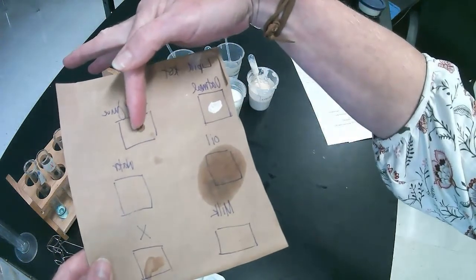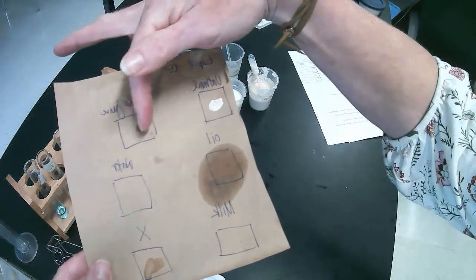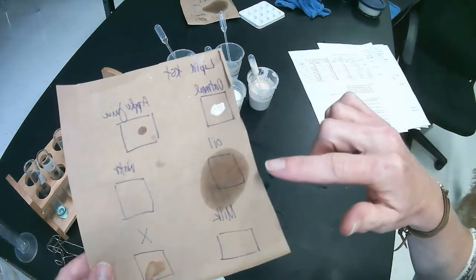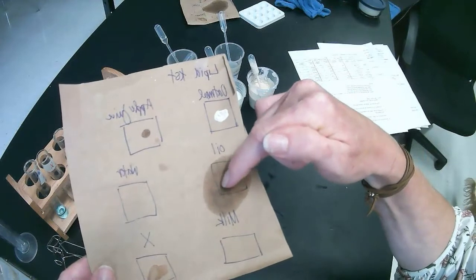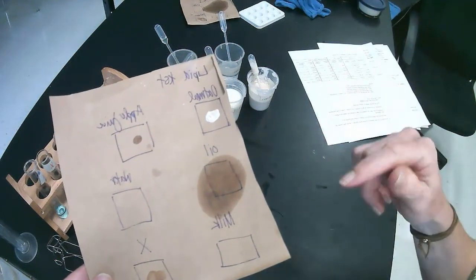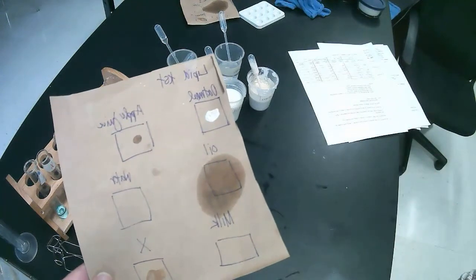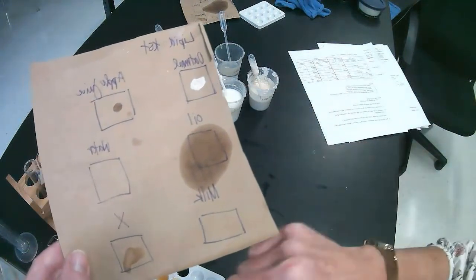Apple juice, again, it just dried. It's a little sparkly from some other things in it, but that was the size of the drop. There's no grease smear. Water just dried, no grease, no lipids in water. But oil, so the original drop was right here, and I think I dripped a little bit out there too. But on that one, that is definitely a grease smear. So that oil is positive for lipids. Our milk did not have any grease smear, so that's negative.